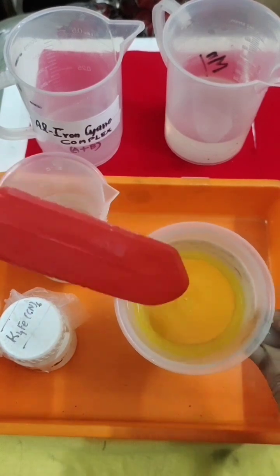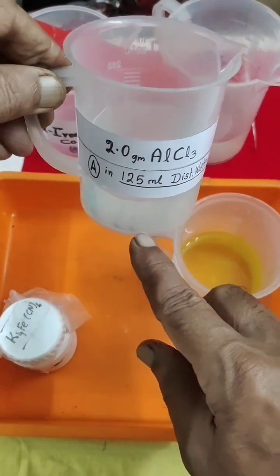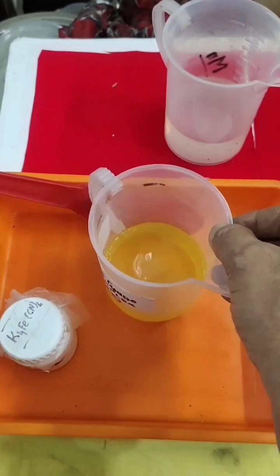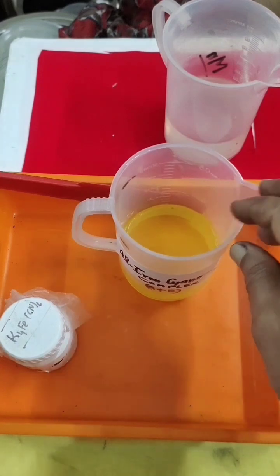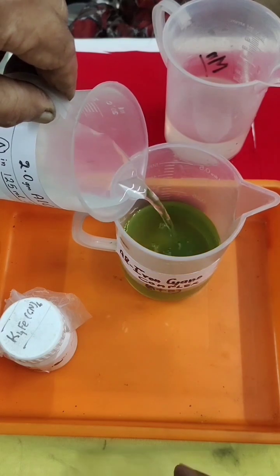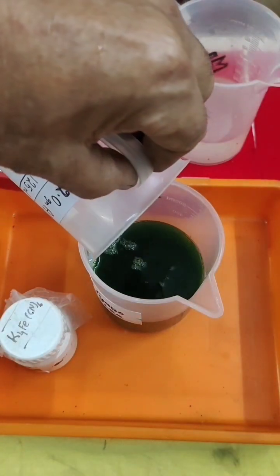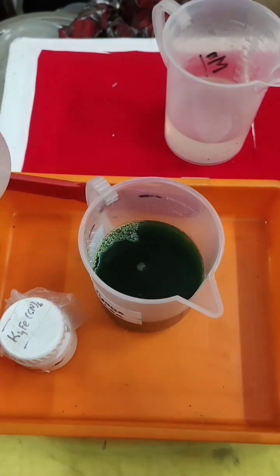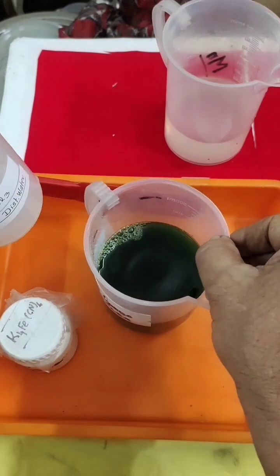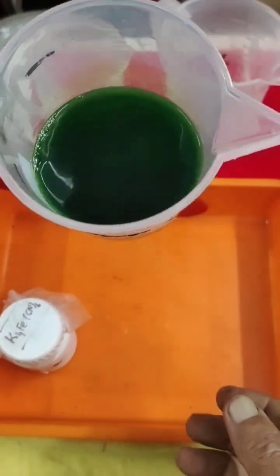It has completely dissolved in the water. Now the next step: I prepared 2 grams of aluminum chloride — the details I'll show you on paper. I am going to add this aluminum chloride solution to the potassium ferricyanide. You can keep it on a water bath to make the reaction go faster and the sediment will form very fast. Now you can see the complex has formed — a greenish-blue complex. This is called aluminum iron cyano complex.